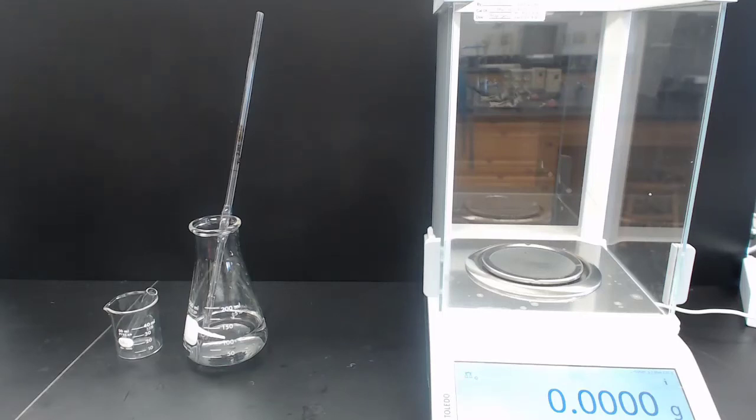In this video, I'll be demonstrating how to find the mass and volume of a liquid using a volumetric pipette. This same procedure will be used in multiple labs, but here I'm specifically showing you for experiment 2, part C, number 2, density of water. And what I'll show you here will be trial 1 data for the density of water.